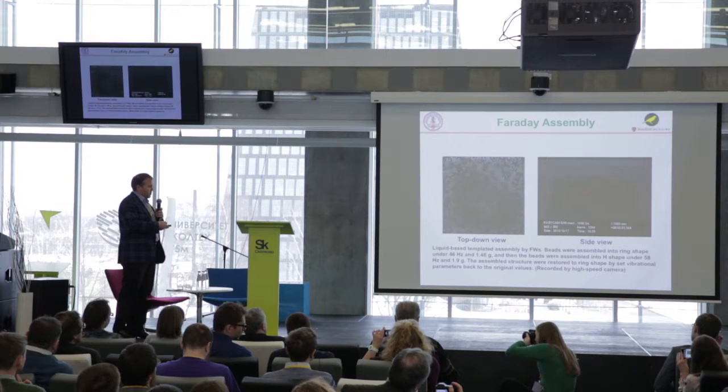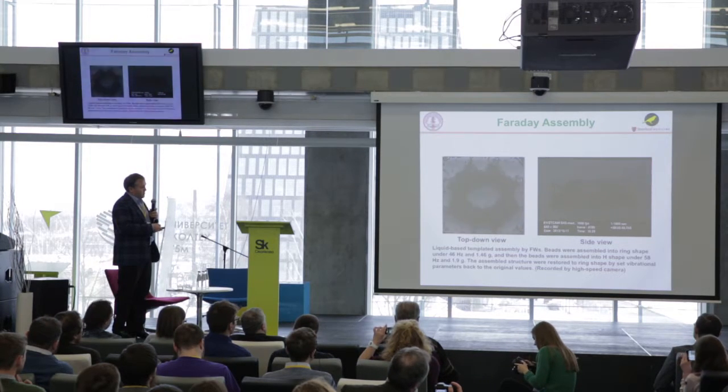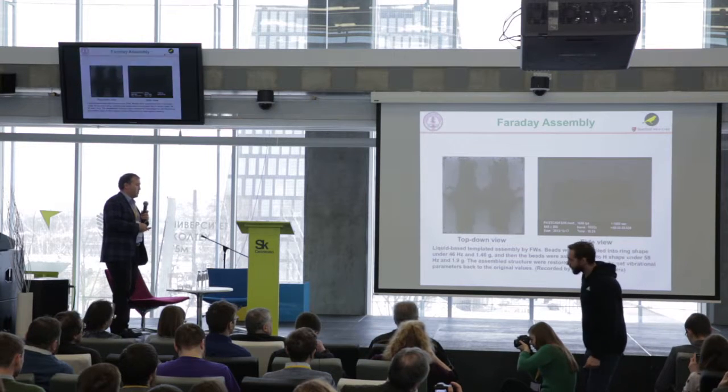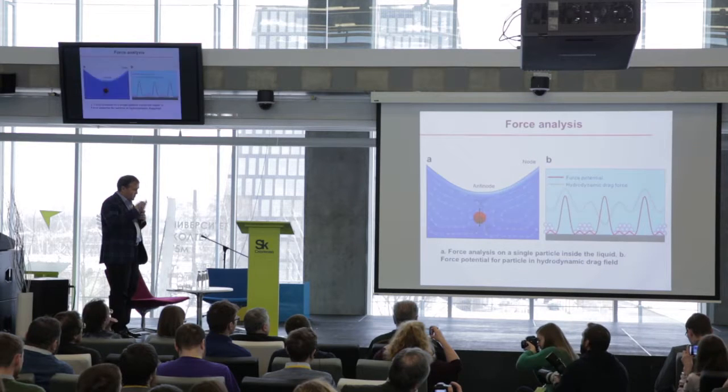As you shake the surface, what's happening is you're creating these standing waves. That's quite simple. And this is a very high-speed camera showing how things are assembling. Now we stop and change the frequency, and then you will see a cross getting assembled with this system. It's quite a simple system that just shakes things.